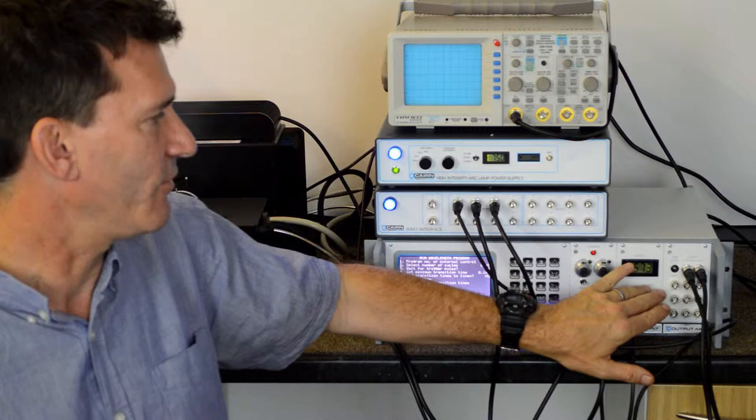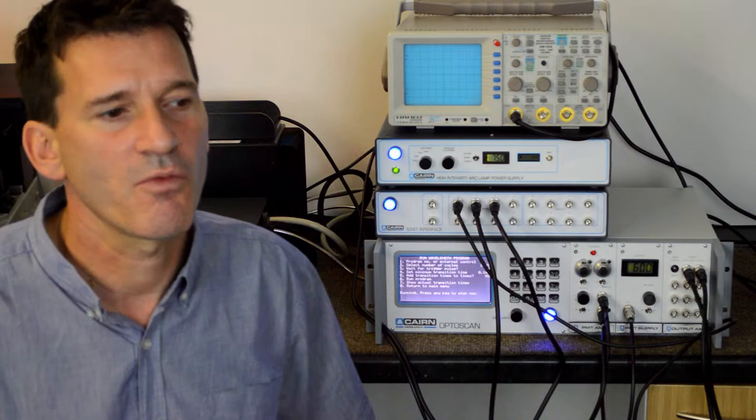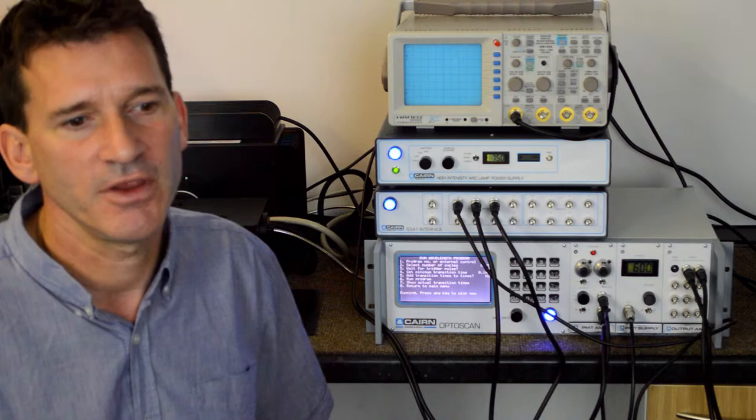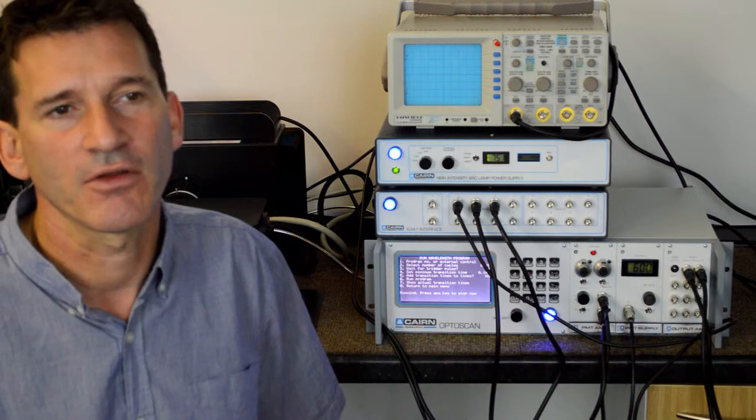So if I reduce the gain, then you'll see I can turn up the voltage to around 600 and get my signal levels around 1 to 4, 1 to 5 volt level. This is where I want to be because I want to be using the digitizer effectively but also leave plenty of room for signals to go up and down accordingly.